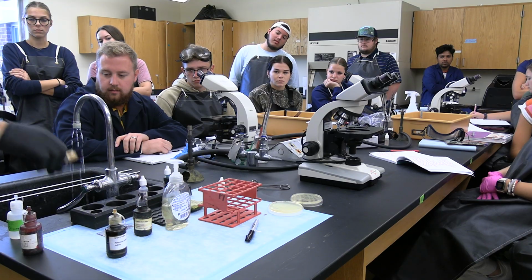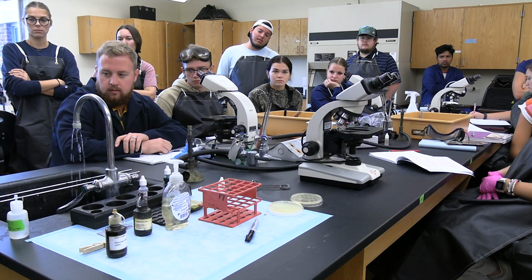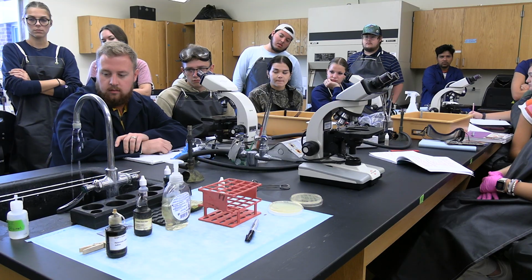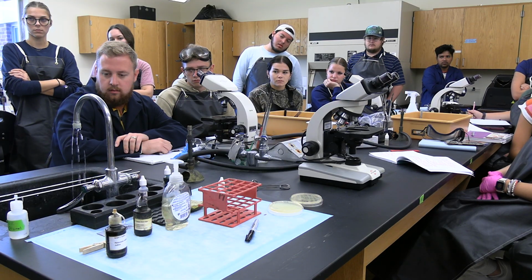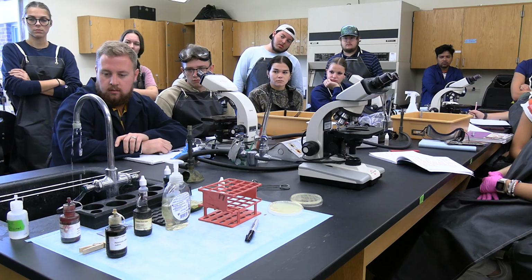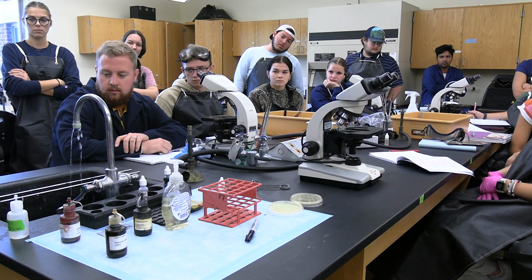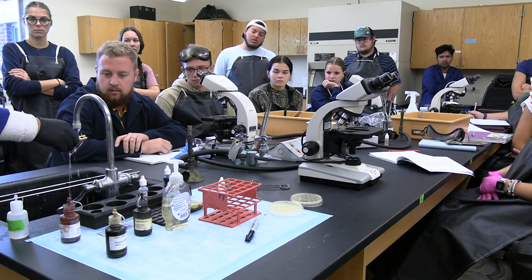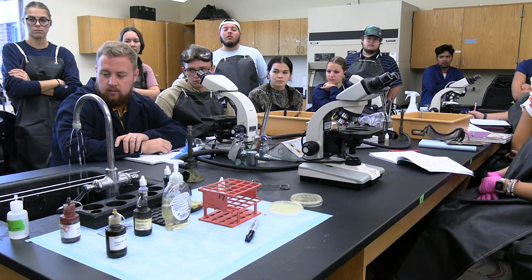Okay, then the final one is a counterstain. Counterstain with safranin. You can add it there. And then how long do we stain? We're staining another 60 seconds. Let's say the time is ready. So we're going to add this. Okay.